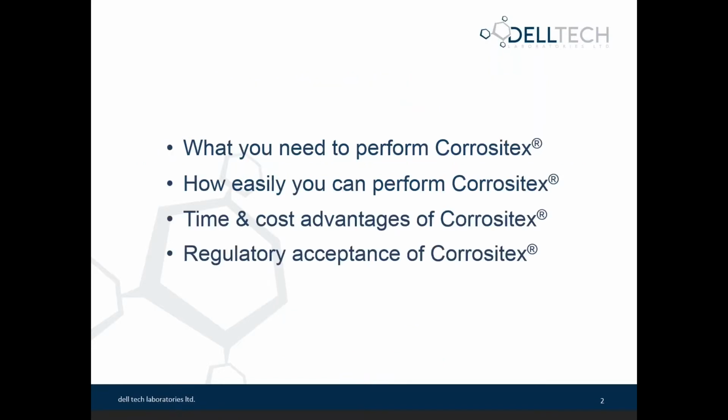What we're going to discuss today is what you need to perform Corrositex, how easy it is to do it, time and cost advantages of using Corrositex, and where and how you can use the results. What's the regulatory acceptance of the test method?